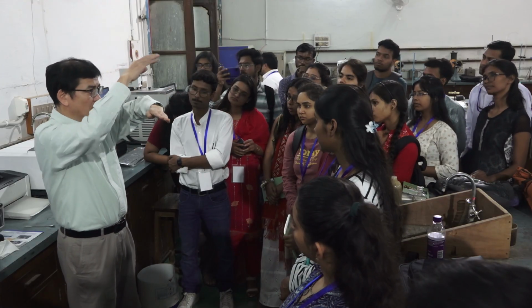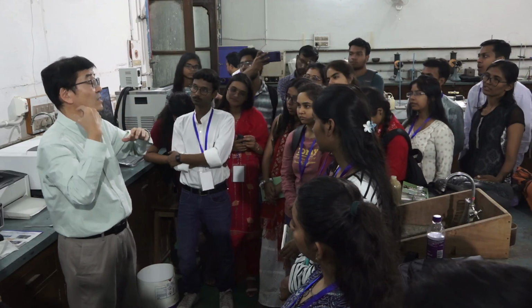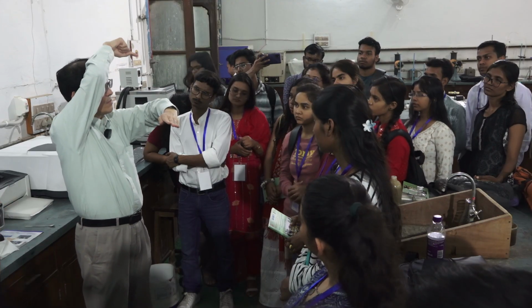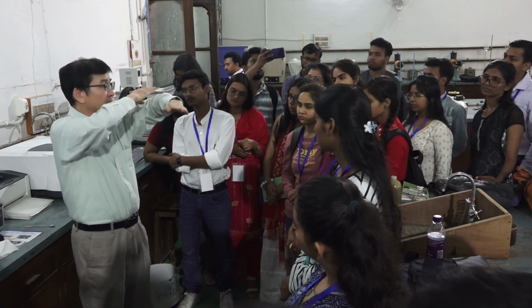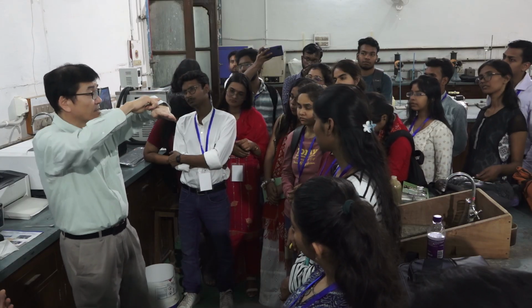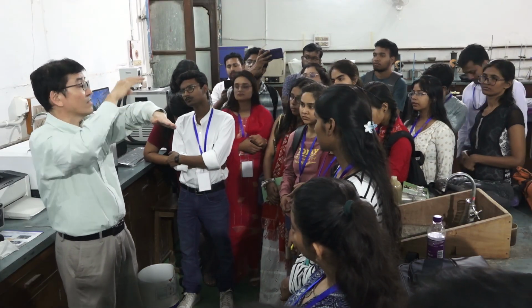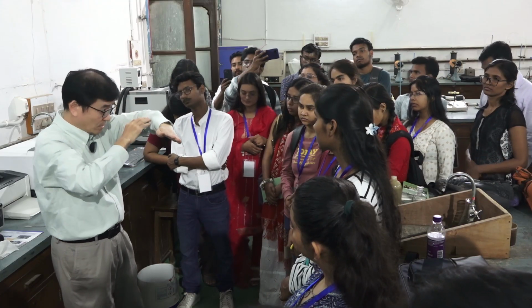That is black for us in the visible region, but it's transparent in the IR region. So this is a prism. Then we introduce the IR beam to the germanium prism. At the interface between the germanium and air, total reflection occurs. Total reflection is the event that occurs at the interface where the refractive index is not continuous.